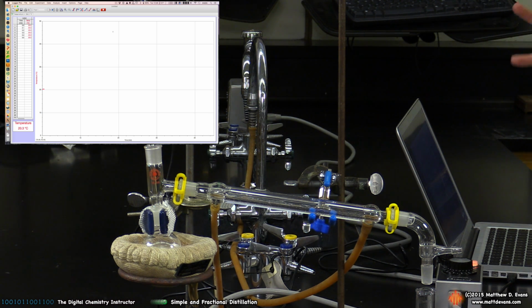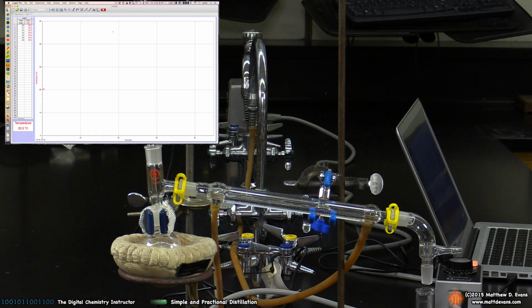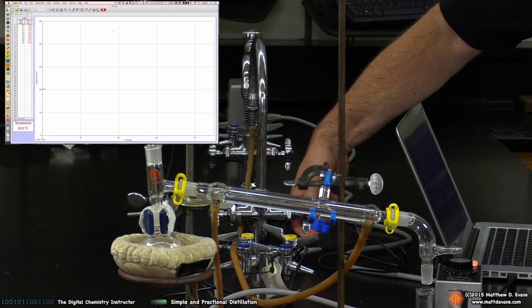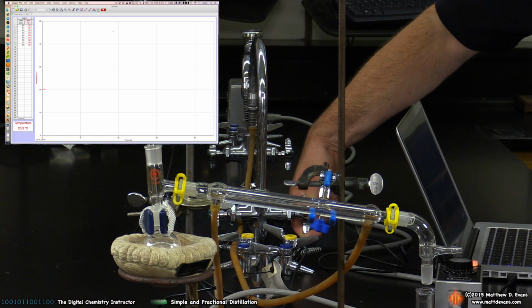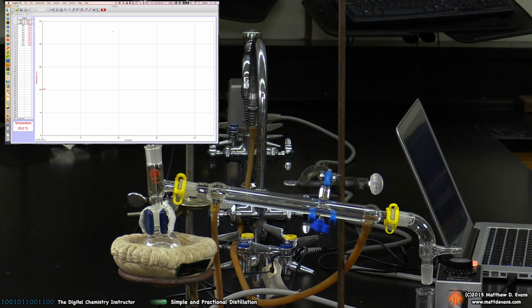Now the last thing, and I almost forgot, the most important thing is to turn on the water supply. So I mentioned before that the water's coming in on the low side, exiting the high side, and just go easy on the water, because I've seen a number of times the water comes out too quickly in the beginning and pushes the hose off. So we want just a steady trickle of water coming out the high side, and it looks like I've got it nailed.